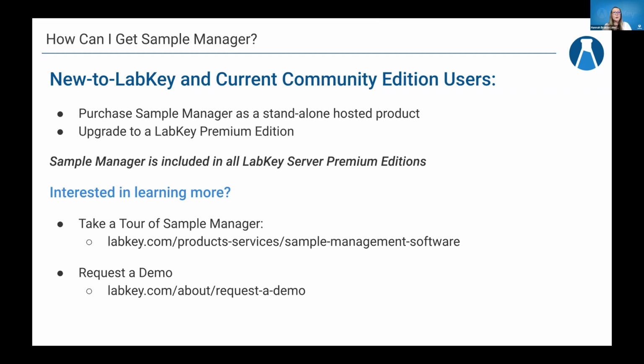You can also upgrade to a LabKey Premium Edition. So if you are a Community Edition user and really are enjoying the features that we have as part of LabKey Server and just want to add Sample Manager, as Anthony and Smiley had talked about, you could do that. Or if maybe you're just interested in learning more, you can take a tour of Sample Manager and send that over to folks and ask them to take a tour or request a demo, likely with me, maybe with Jason or Steve or others at LabKey. But I love doing them. They're always really fun. We like to put it in as much context as you need, and we go from there.